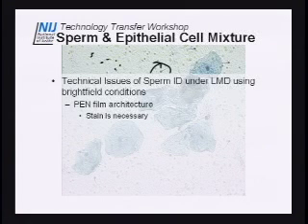So again, the pen film architecture. That's why I say right now a stain is necessary, because if you look at an unstained slide, it is kind of hard to see unstained sperm with all those pores. And when Pat talked about using DIC, those pores even get worse if you use DIC at this point.